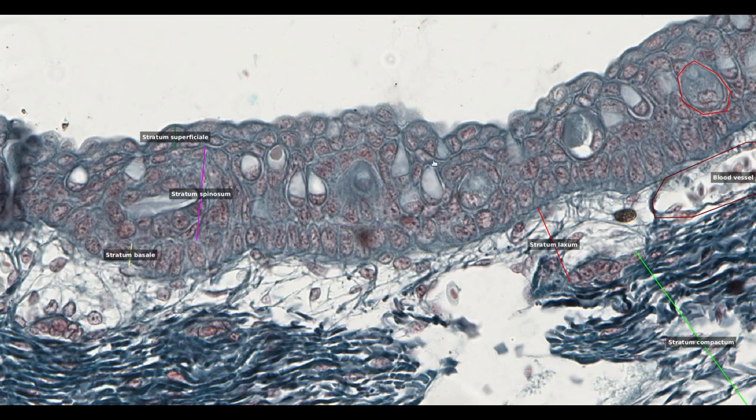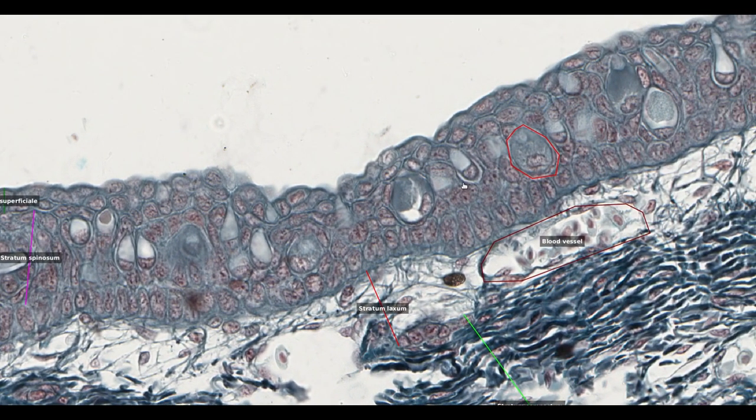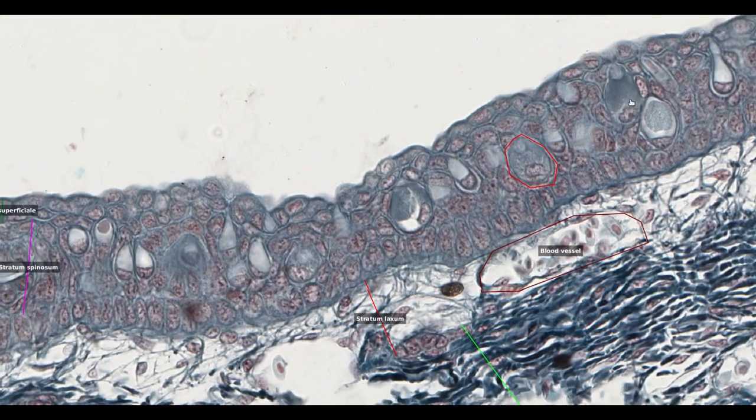From light microscopy alone, it's difficult to know if there is more than one kind of secretory cell in the skin. Perhaps the larger cells with darker staining contents are a different cell type to the ones with lighter staining content. Or they may simply represent the same cell which is so full of content as to alter its appearance.